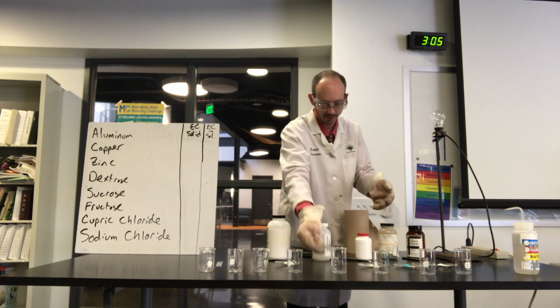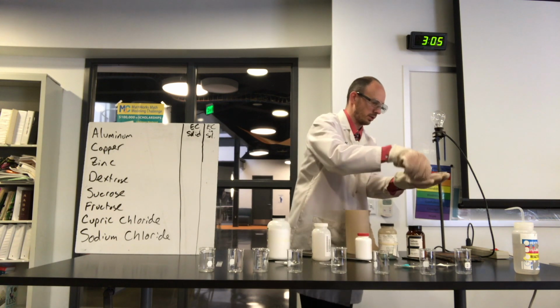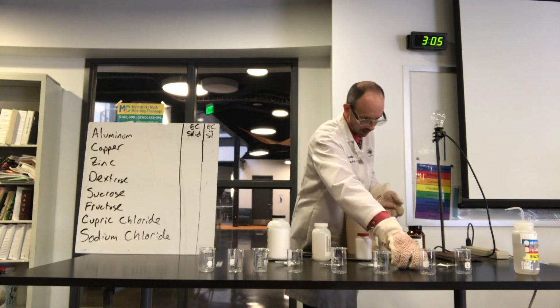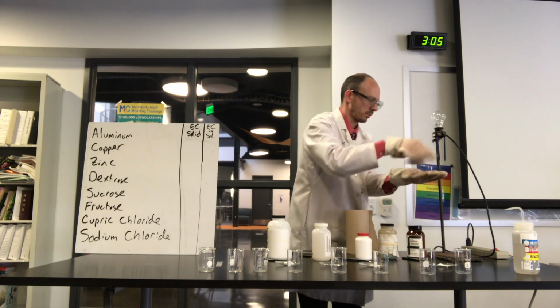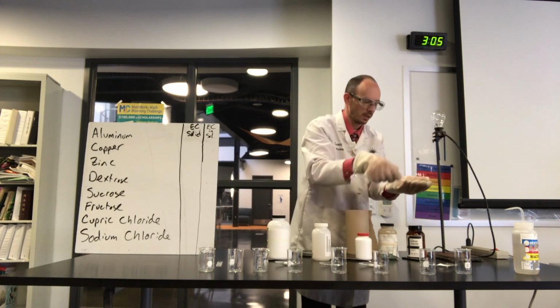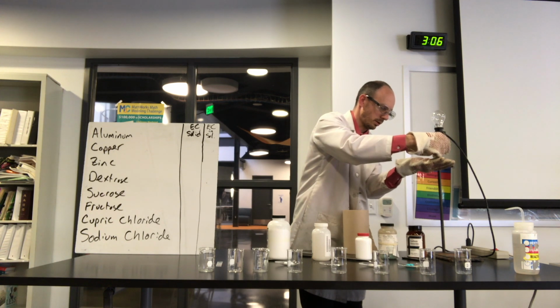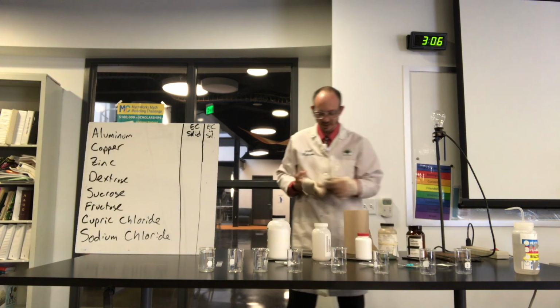Sad, nothing's happening. All right, we'll go fructose. Nothing. And let's go copper chloride. Nothing. And one last one, salt. Salt's got to do it, right? Wrong. Okay, so one more test.